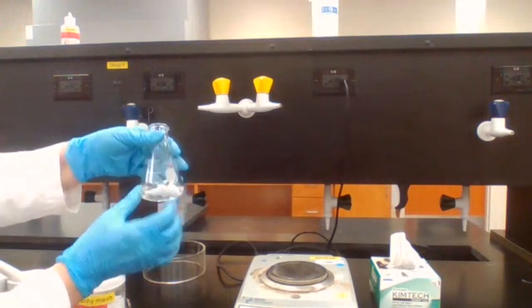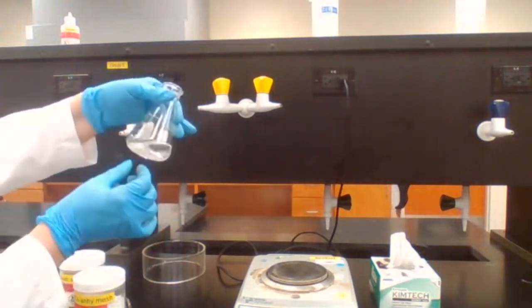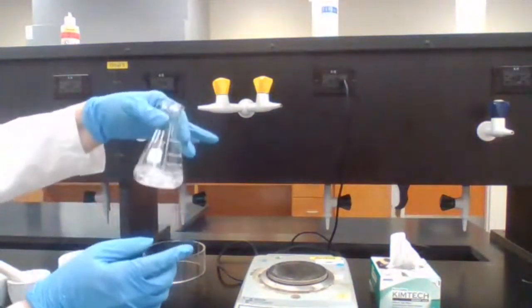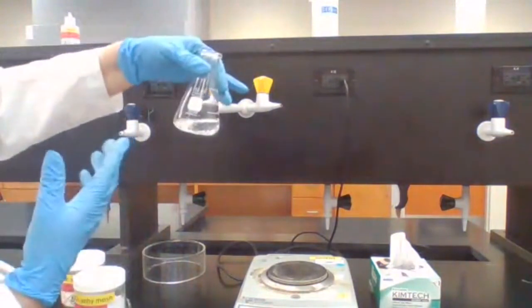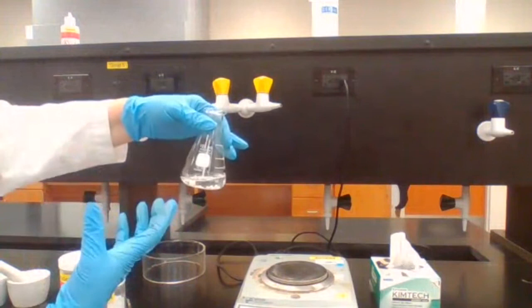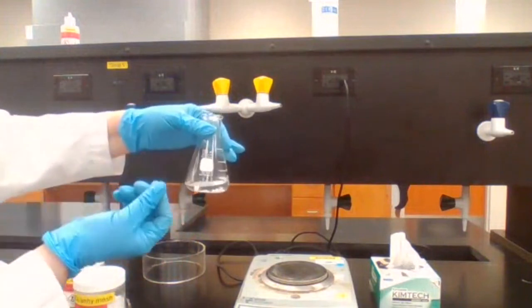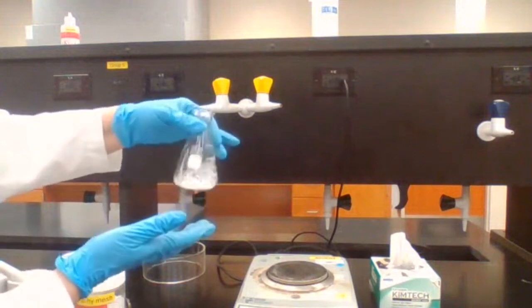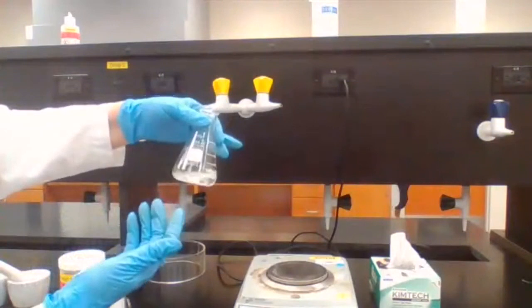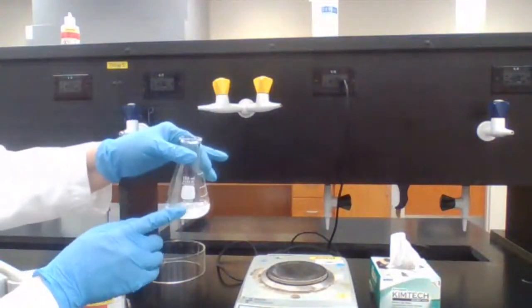So when you look at this, now the little crystals or balls of the calcium chloride, if they are moving around, that means they have not absorbed water and they are not saturated. If they absorb water, they become like a paste and they stick to the bottom of the flask. They don't move around. That means they are already saturated with water. In that case, you would need extra calcium chloride to add.